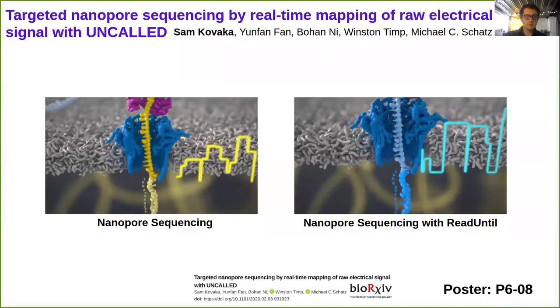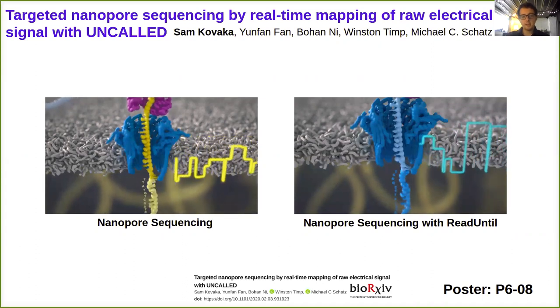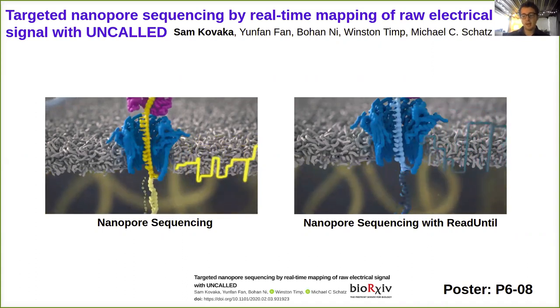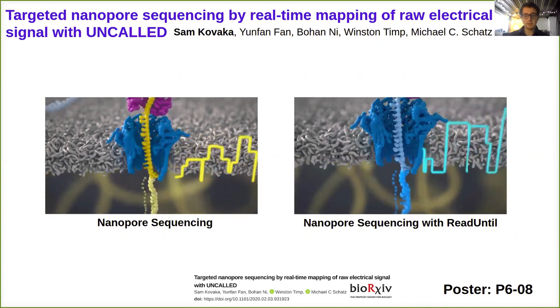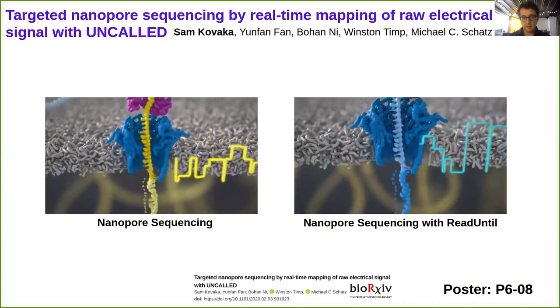I'm a PhD student at Johns Hopkins, and I'm here to talk to you about my work on targeted nanopore sequencing. So oftentimes in your sequencing, you don't care about a lot of the DNA that's in your sample. For example, if you're trying to diagnose a pathogen in a person, the vast majority of your reads would come from the human and not the pathogen that you're interested in. Alternatively, if you're just trying to sequence a certain panel of genes, most of your reads would come from the rest of the human genome, which you don't care about.